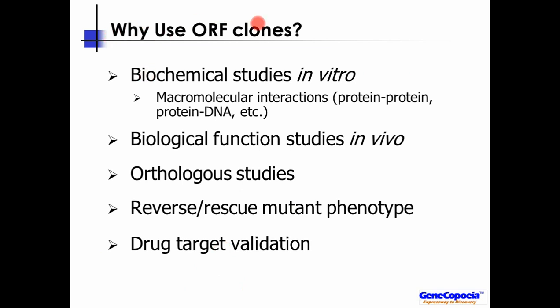All right, so the main focus of this talk is ORF clones. Well, why should you use ORF clones? Well, there are several good reasons listed here. The first is you can carry out biochemical studies in vitro, and most of these are based on macromolecular interactions such as protein with protein or protein with DNA, etc.